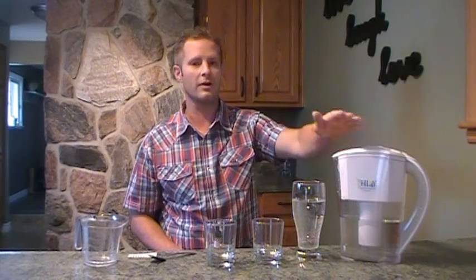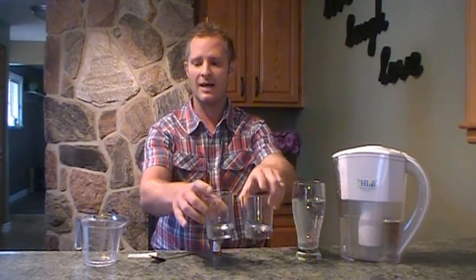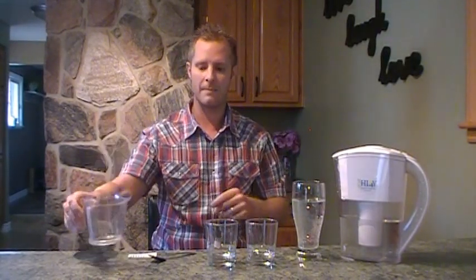So we have the Alka Pitcher full of water and we also have tap water straight out of the tap. The tap water went into the Alka Pitcher, filtered through, and this is just tap water straight out of the tap. I have two empty glasses, a measuring cup, a spoon to mix it, and I have pH reagent.